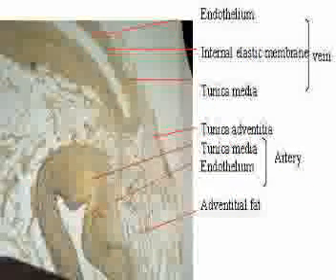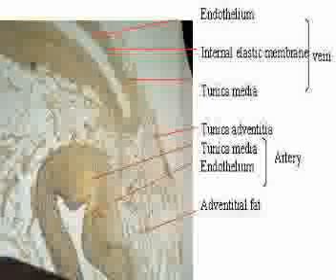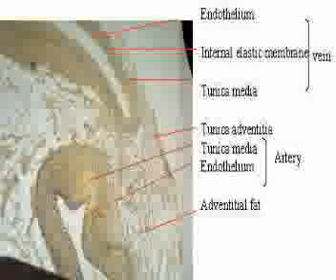Artery and vein or blood vessels. They are made up of three layers: tunica intima, tunica media, and tunica adventitia. The intima consists of the endothelium, basal lamina, and subendothelial cushion. The media extends from the internal elastic lamina to the external elastic lamina in most arteries.